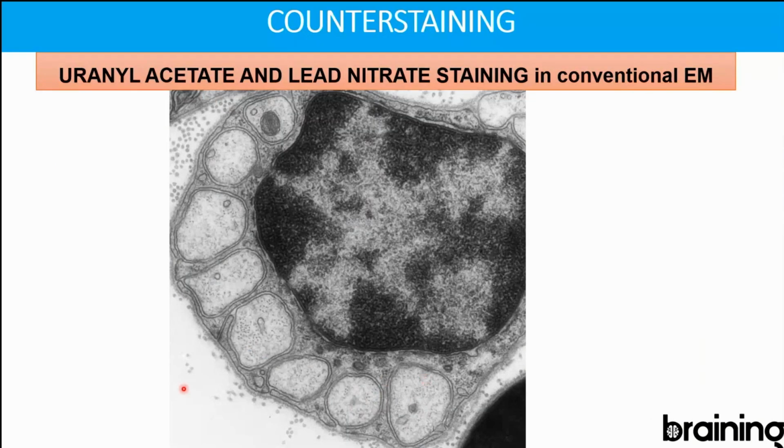And I told you in the beginning, after all this, you are going to have to do some staining in your grids, okay? Before looking at those grids in the EM. This is similar to when you are staining some sections, like cryostat sections or even paraffin sections on your glass slides. Okay, so you're counter staining so you can see something else. So this is something similar.